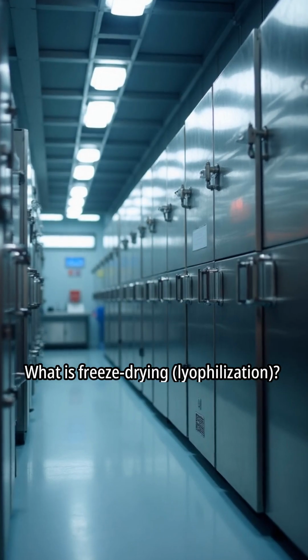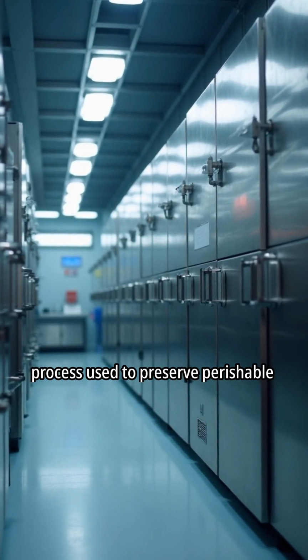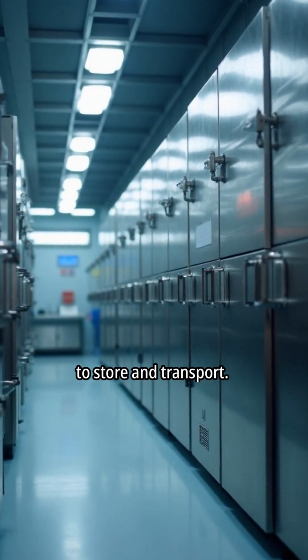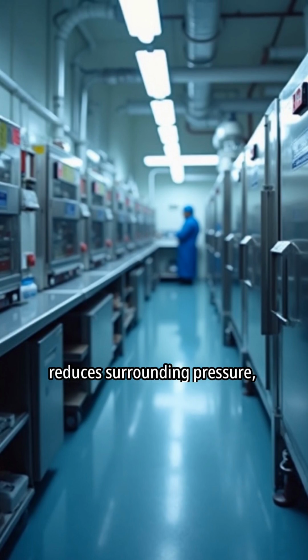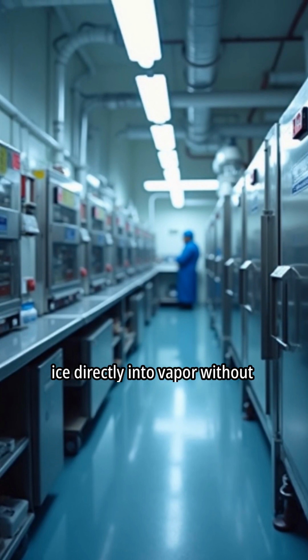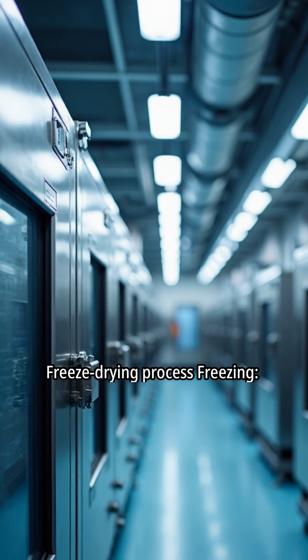What is freeze drying? Lyophilization. Freeze drying is a dehydration process used to preserve perishable items. It makes products easier to store and transport. The process freezes the product, reduces surrounding pressure, and removes ice by sublimation, changing ice directly into vapor without becoming liquid. Freeze drying process. Freezing.